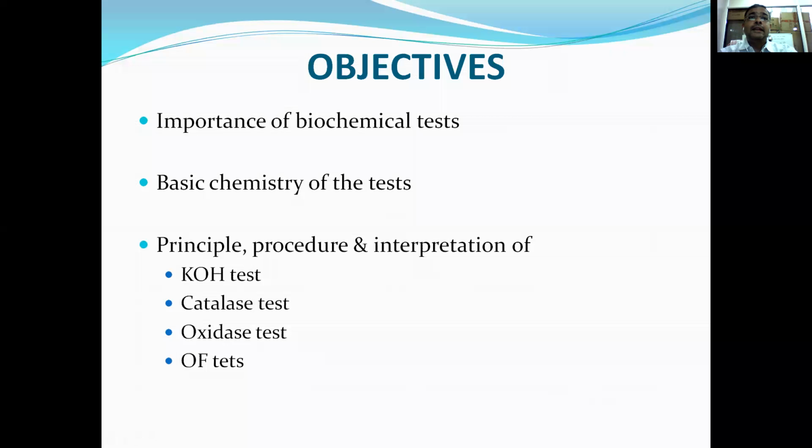Then I will give a glimpse of the basic chemistry, that is, how these biochemical tests are performed, or what the basic theory behind performing them is. And at the end, we will try to understand the principle, procedure, observation and interpretation of four biochemical tests. Other biochemical tests I will take up in the next part, biochemical test part 2.